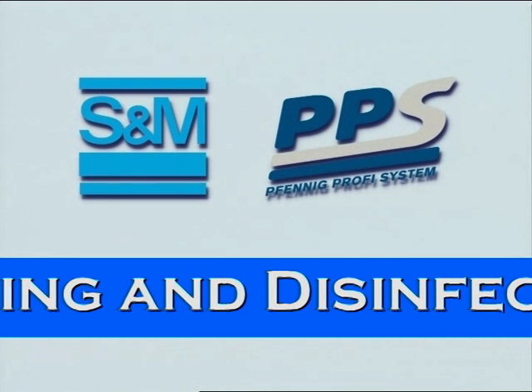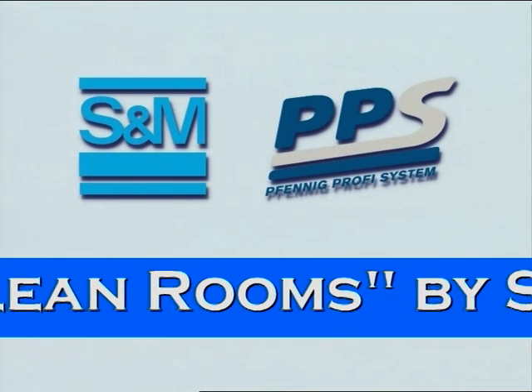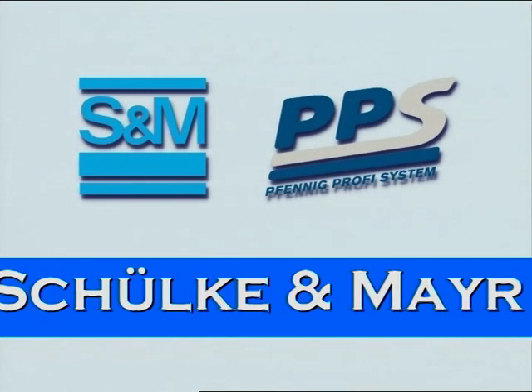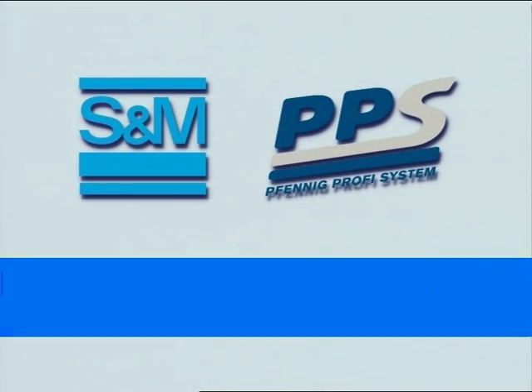This film concentrates on the topic of cleaning and disinfecting clean rooms. We will accompany you throughout the film, so you will know by the end of it what is particularly important, and naturally how you can work more safely and, above all, more easily.